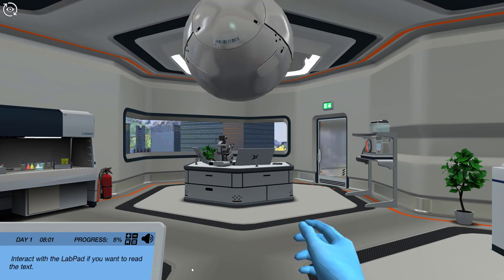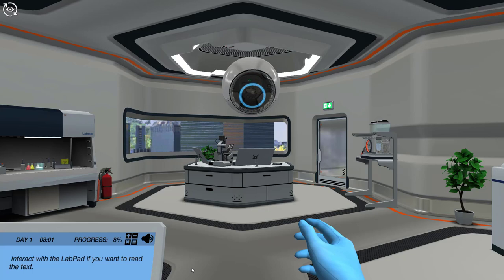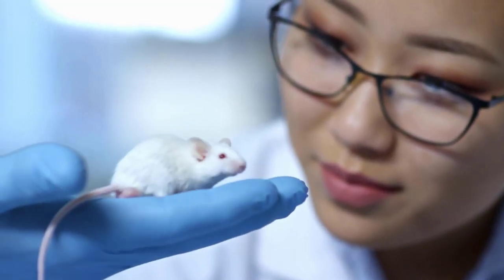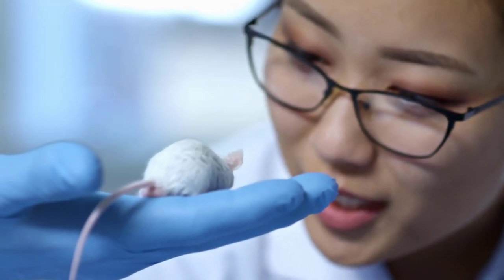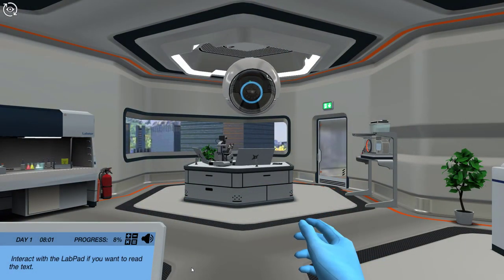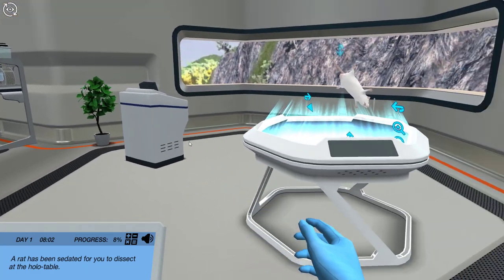Hi, I'm Dr. One. I saw how perplexed you and your friends were about the different muscles for running and walking. Today, discovering the difference begins with dissecting rat muscles for the experiment. A rat has been sedated for you to dissect at the holo-table.